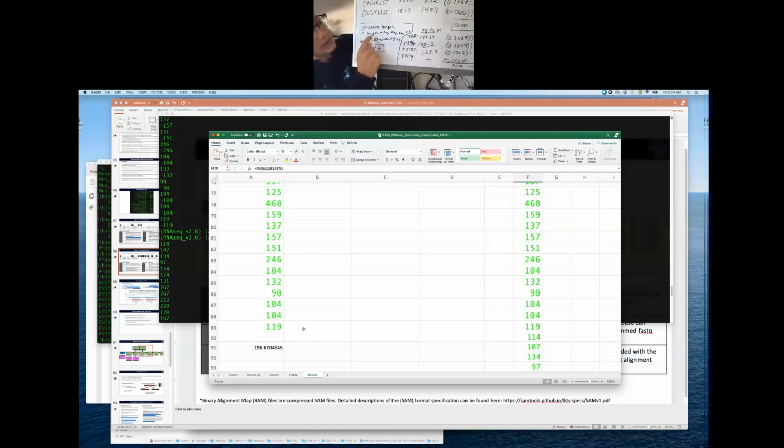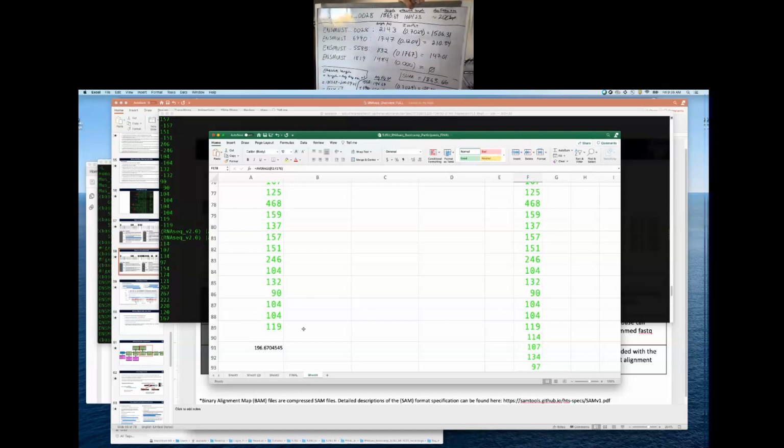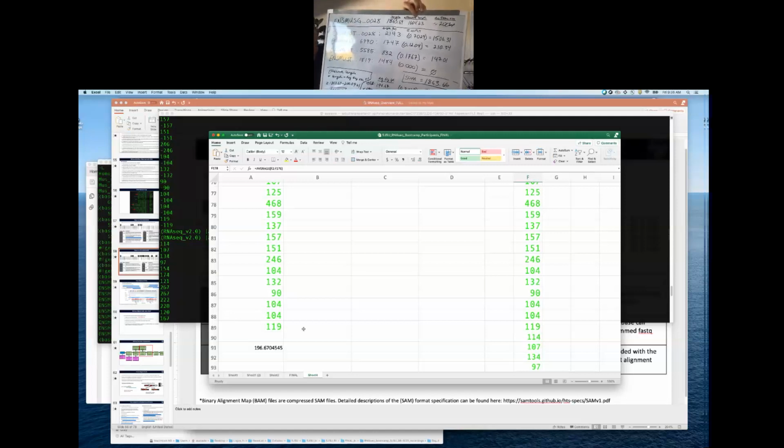And then what we see here is we take that length, that 1863.69, subtract our average fragment size, which again was weighted based on the expression of each one of these transcripts, and then add 1 to that to give us our effective length, which is 1664.6, and again, pretty close. The effective length actually calculated by the program was 1664.23 for this gene, for this sample. And so again, I assume that that's probably rounding. And so that's how that effective length is calculated.